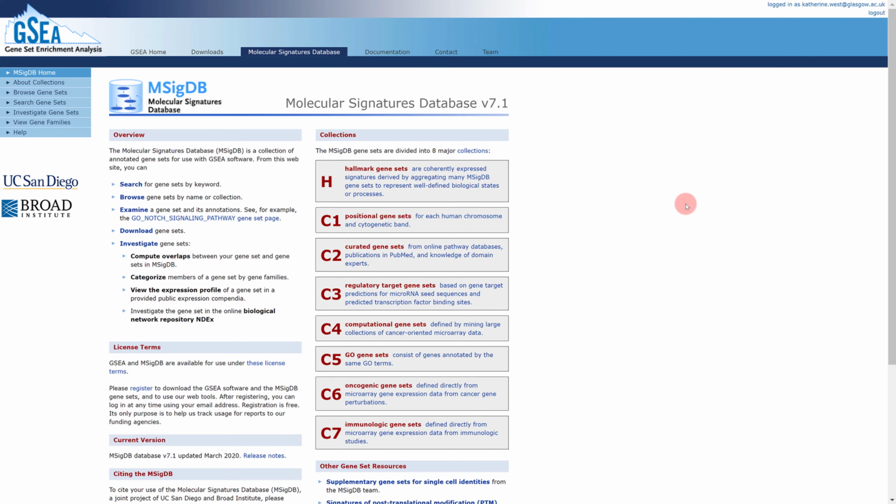And that's great for getting an overview of what's happening. But when you start to look at the false discovery rate, the Q value, for every additional gene set that you're testing, you're going to reduce the significance of those that are pulled up as being changed. So you might want to focus your gene sets on a particular question or biological system related to the question that you're addressing. And so you can use the search function to pull out gene sets from all those databases that are related to a particular pathway you are interested in.